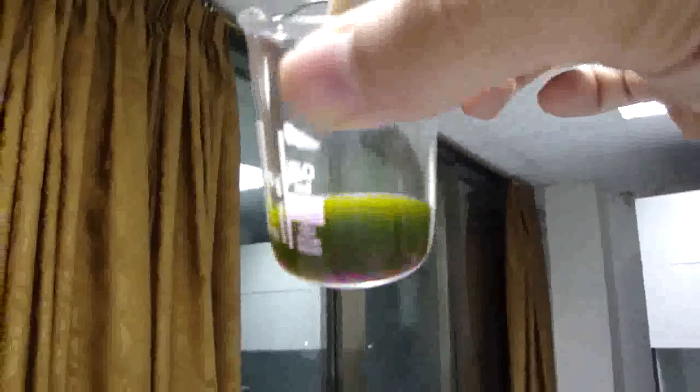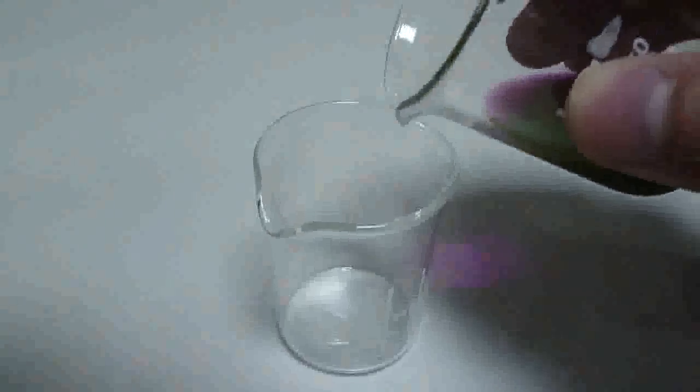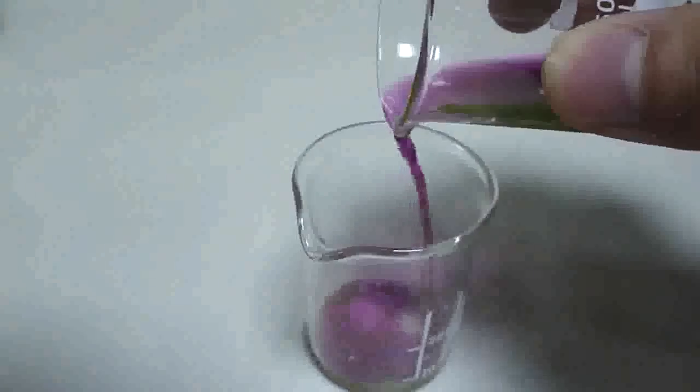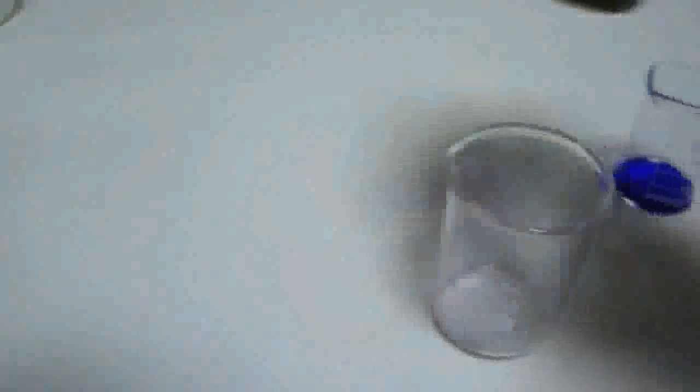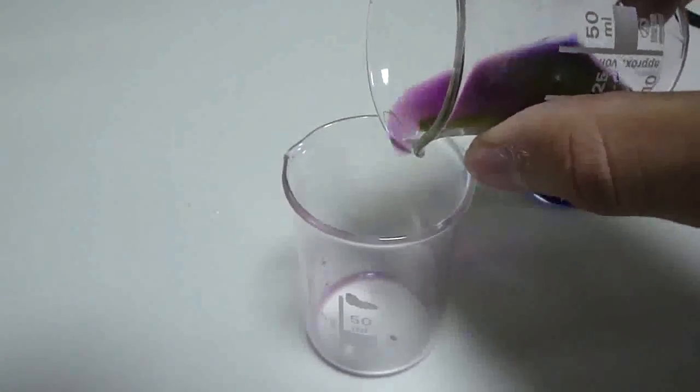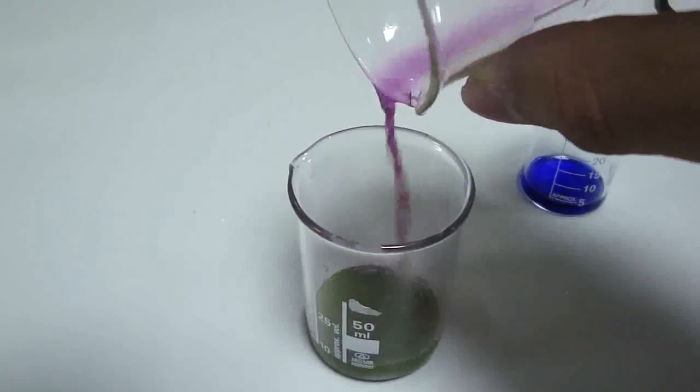So as you can see, violet and green. And when I pour it to another bigger beaker, we can see it has two colors. Violet, and it will become green when it's condensed. And again, violet and green.